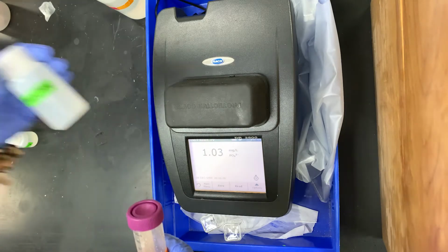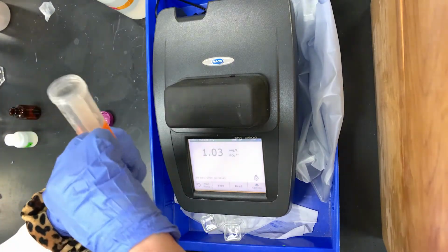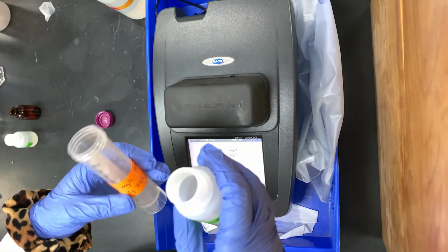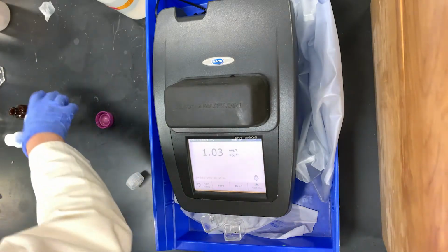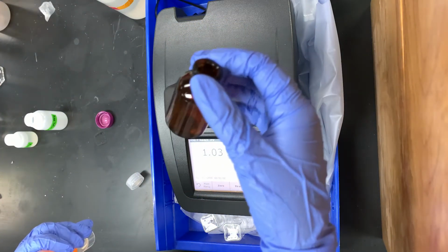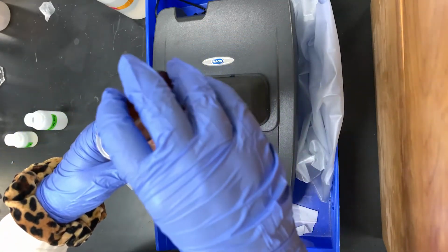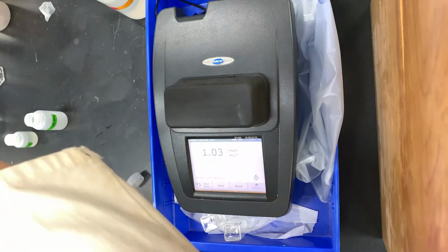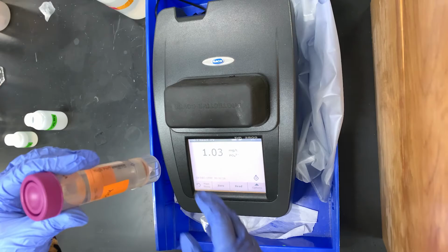Now that we have the initial concentrations of all of our standards, I did the other 3 off camera, we can start the adsorption of the phosphate onto the iron-coated sand. We will take our remaining standard, which is about 50 mils, and add it into this 50 ml centrifuge tube. I'll also be adding in our 1 gram of iron-coated sand, which is the mass I'll be using for this demonstration. Again, for the lab, there will be 2 masses of iron-coated sand tested, one at 1 gram and one at 2 grams of sand.